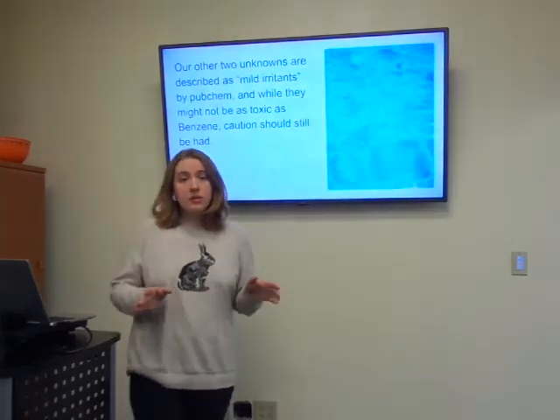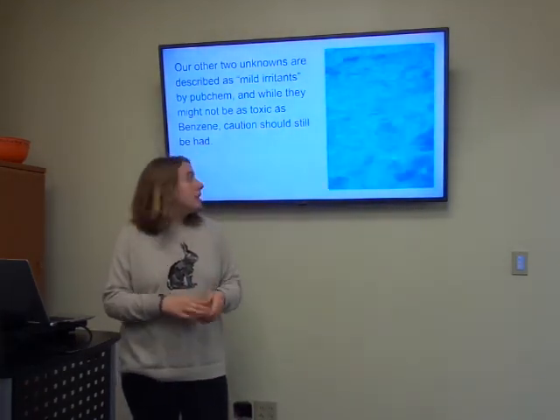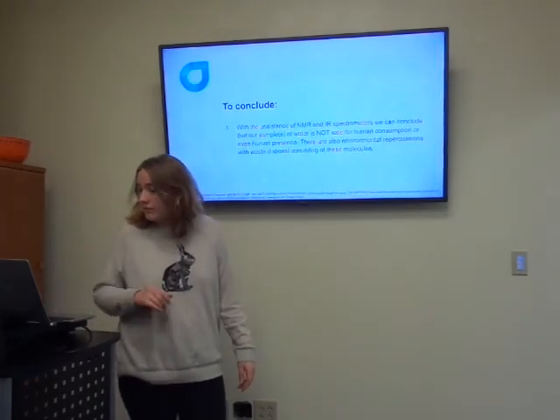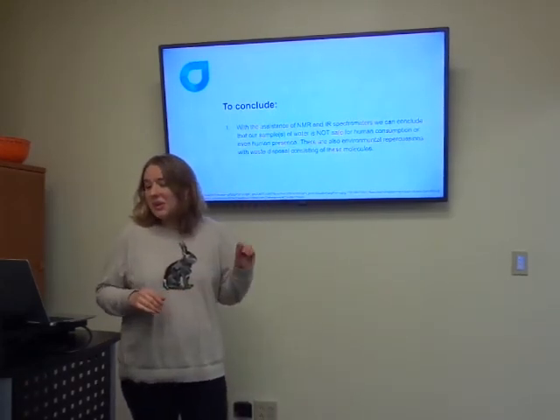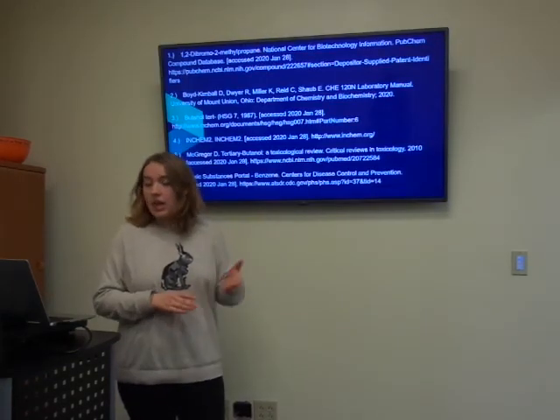Our two other unknowns are described basically as just mild irritants by PubChem, but it's better safe than sorry. Not something you would exactly want to consume either. So just to conclude, with the assistance of NMR and IR spectrometers, we can tell that our substances aren't safe for human consumption. And here are my references.